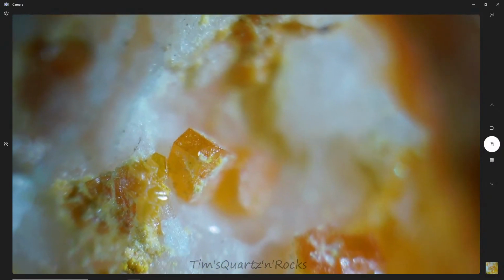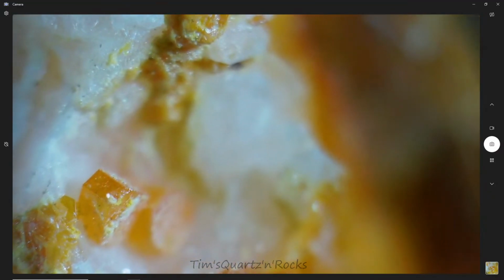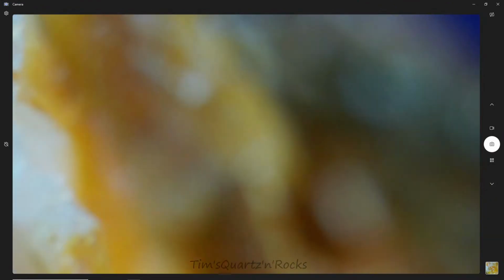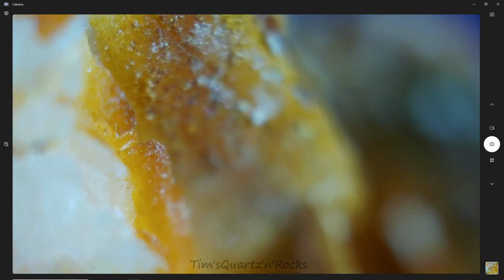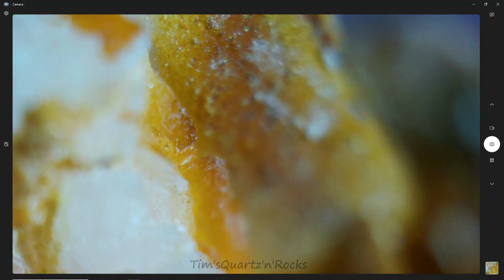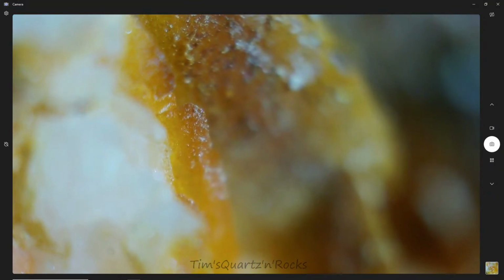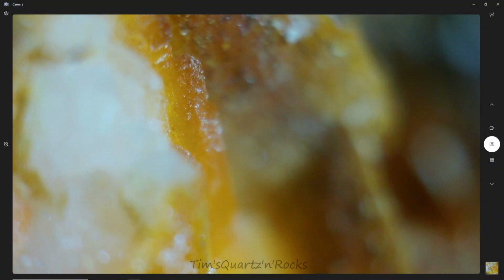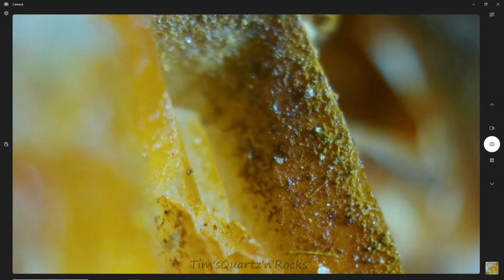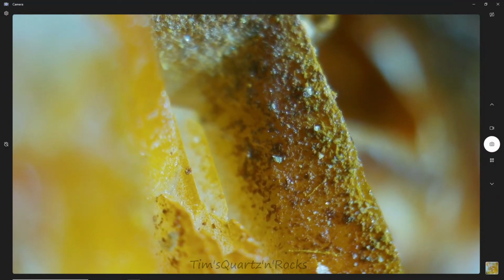And this is towards the edge where I was talking about earlier, that I was quite interested in seeing the color, and here we see the color, but not the distinct hexagon shape, except for, well, they're at the edge. You start to see the hexagon edges, I suppose. Well, that almost just looks, well.